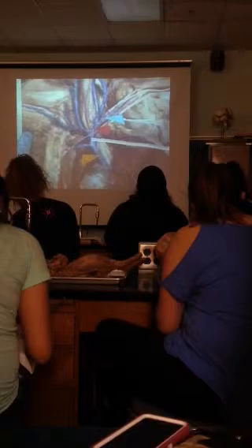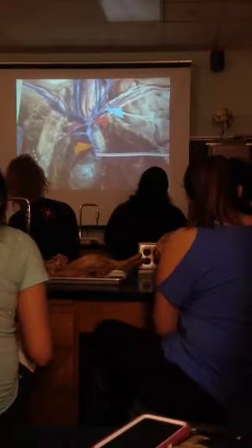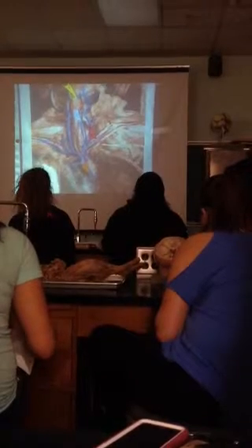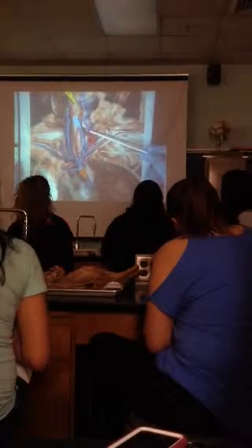Okay. Coming down here, those are going to drain the arm region and the neck region right at these 2 points. Brachiocephalic. Brachio meaning arm, cephalic meaning head. And then when it drains right into one pipe, straight into the heart, it's superior vena cava. Yep, superior vena cava. So it would be like this on your test, 4 points, right? And it would say, tip of the orange arrow number 1 is on the superior vena cava. True. Tip of the orange arrow number 2 is on the external jugular vein.